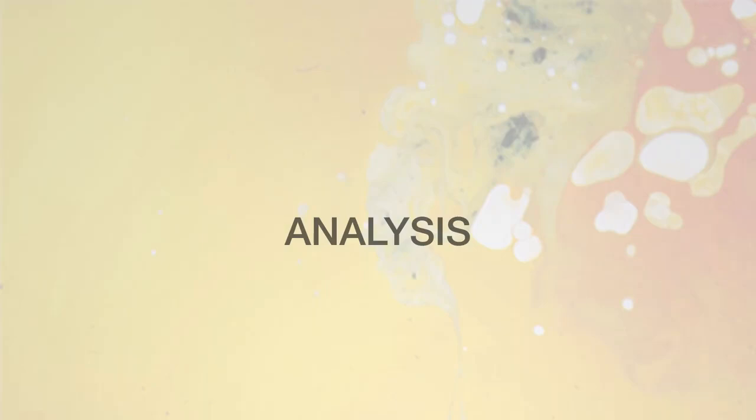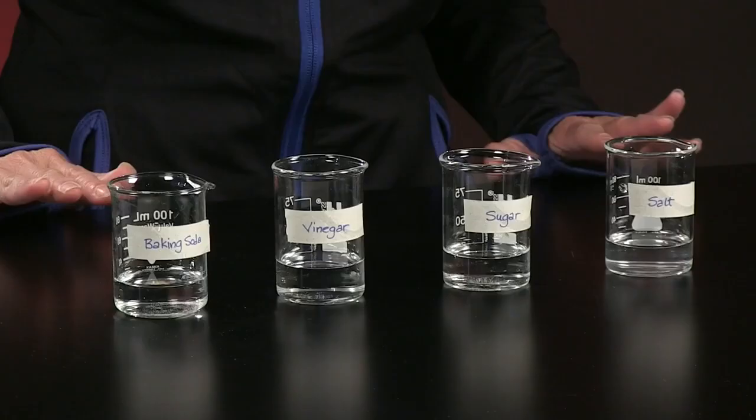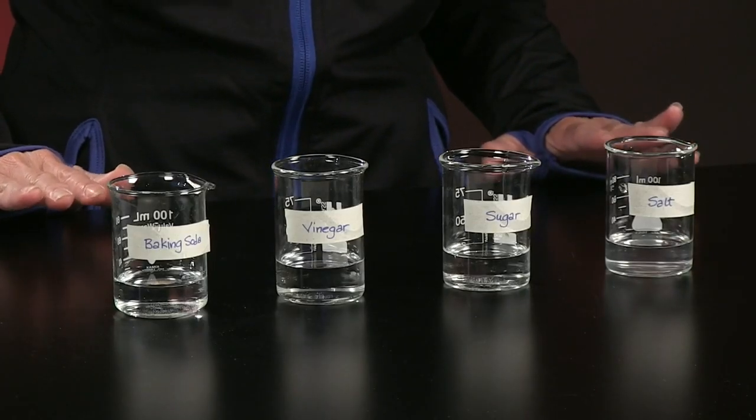It's time for us to think about what these solutions are in terms of the kinds of bonds that hold their molecules together. The conductivity of a compound in solution really depends on its ability to form ions in solution. Of the compounds that you tested today, I want you to look at the data and determine which ones of your samples from today produced enough ions to show significant conductivity.